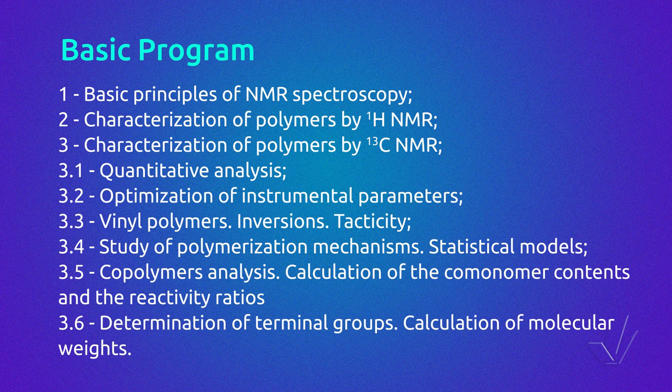Determination of terminal groups by NMR, and calculation of molecular weights of polymers. So, let's start with the basic concepts.